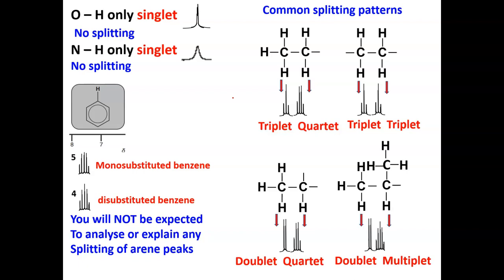And then we get a rather interesting thing here. We've got here a doublet and a multiplet. This is a carbon with a branch on it, a methyl group, and of course the end of the molecule with 2 methyl groups. Those 2 CH3 groups will of course be an equivalent environment of 6 protons, and they will obviously cause a splitting effect. And this is what happens. The solitary H on the carbon will be split into a multiplet, which is lots of peaks, of course. You won't be able to count them, there's so many together. And of course, the methyl group's signal will be split into a doublet because of the solitary H on their shared carbon.